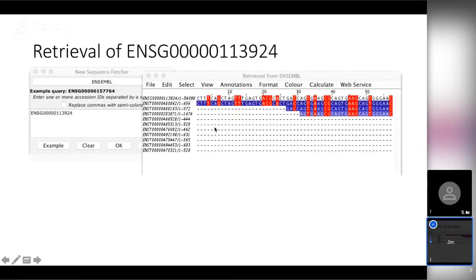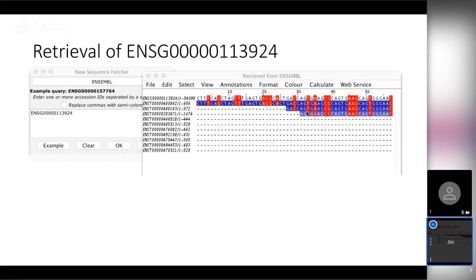Jalview shows it to you as an alignment. At the top you have the genomic sequence — the locus — and there are red rectangles highlighting particular bases. Those are features from Ensembl highlighting positions where there are nucleotide variations — these are SNPs, population genetic information. Some of these SNPs have been classified according to whether they cause pathogenic diseases or other conditions. Below are all the transcripts, shown aligned to the reference genome, giving you a very similar alignment where you get T's rather than U's — DNA rather than RNA representation. The transcripts also inherit the single nucleotide polymorphism features as red lozenges.